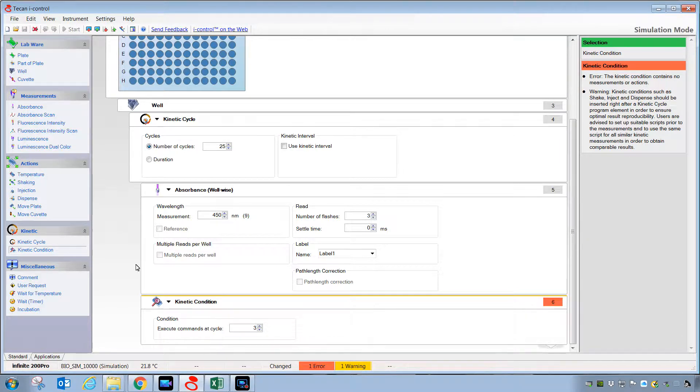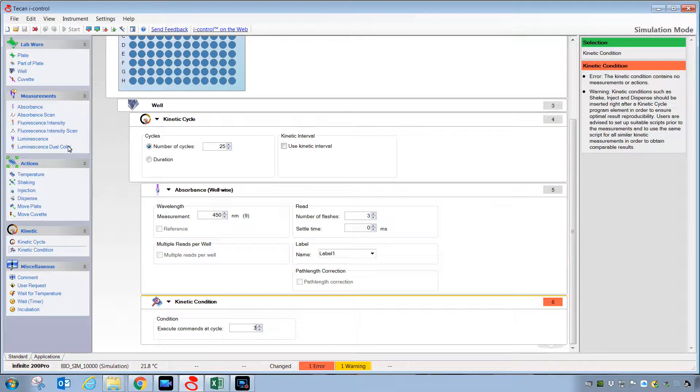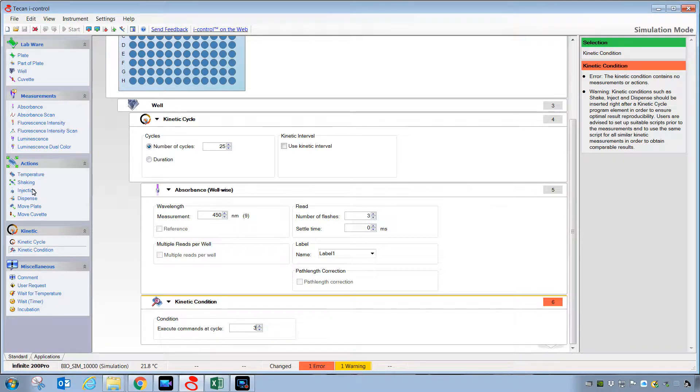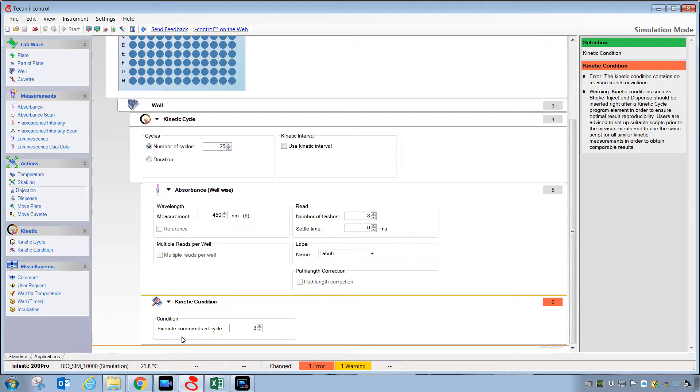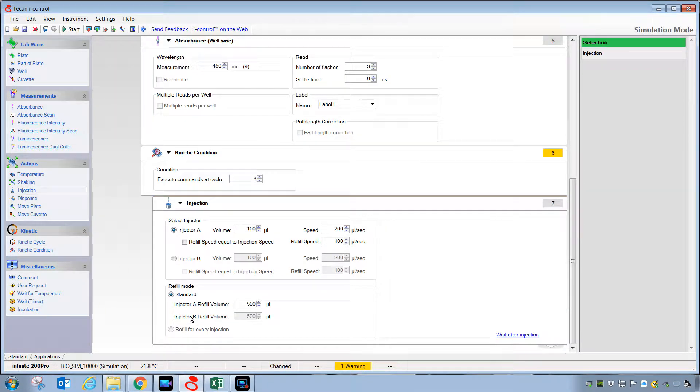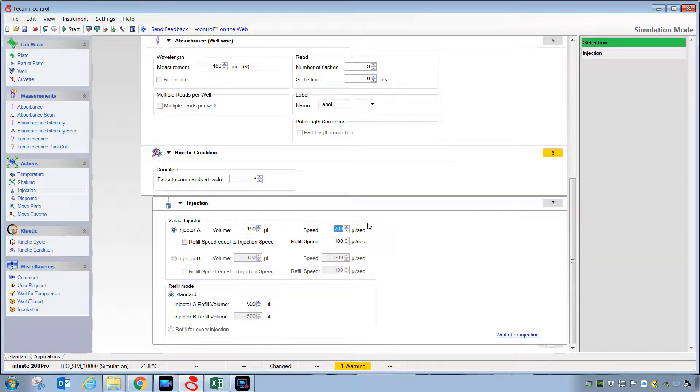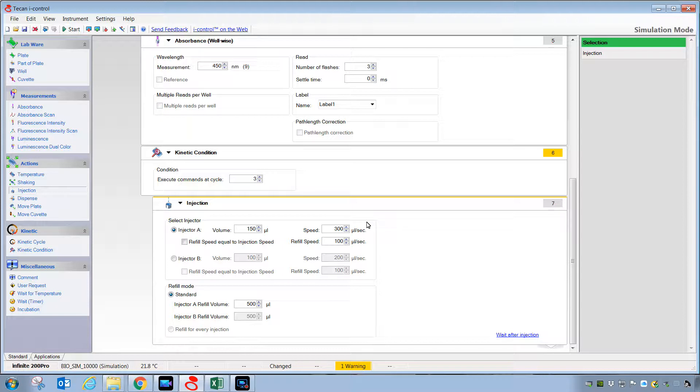Then, after that, to implement injectors with well-wise strips, we're going to use what's called an injection step. We're going to define a volume to inject and the speed of the injectors. Here, we're using the maximum microliters per second to get good mixing.